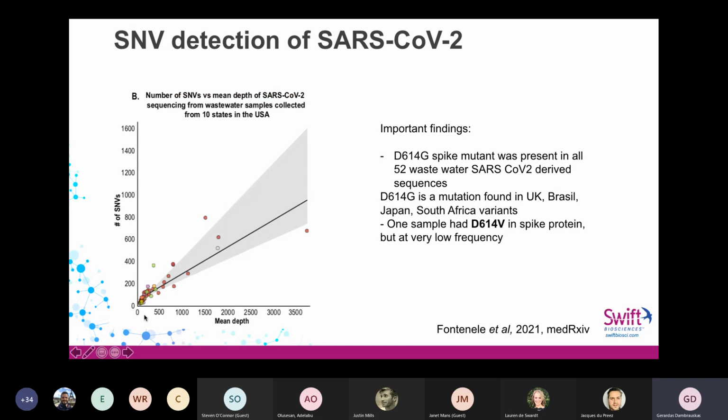The important finding from the paper, which is quite interesting, is that most of the variants, which you can see here on the right, were detected with less than 500x coverage. With some, as you can see here, the coverage needs to be increased to detect them. But in most of the samples that we sequence, we see the coverage sometimes going to 50x, 100x, and on 50,000 reads, 1 million gives you 100 times of that coverage. So you can see, you can go into rare variants.